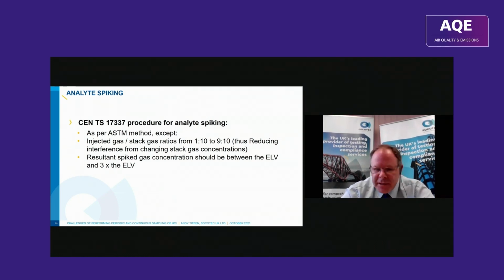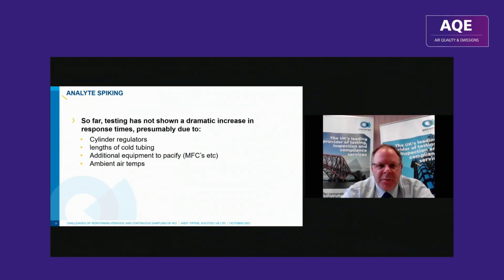So up at those concentrations, we did some testing to see whether or not we managed to get an increase or perhaps a decrease in the response time. Faster result, more stable result from the system. And we've done quite a bit of testing on this over the years. A large project last year to see whether or not analyte spiking was a really viable method for validating the systems. And what we've seen is, yes, there is a slight increase, but not dramatic, not really enough to warrant the additional hassle of trying to do an analyte spike on site.